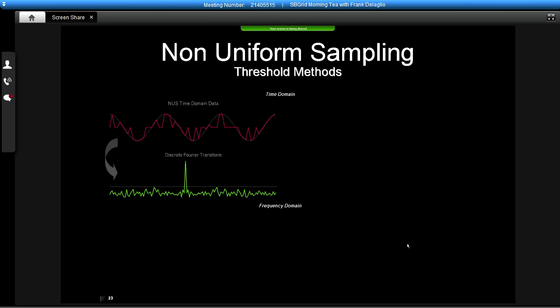And the idea that we talked about is that for a given signal in the non-uniformly sampled spectrum, we can anticipate exactly what the shape of the corresponding artifacts would be in the baseline. So it's possible for us to choose a threshold which we know will always be larger than these artifacts, because we know more or less exactly what these artifacts are going to look like.